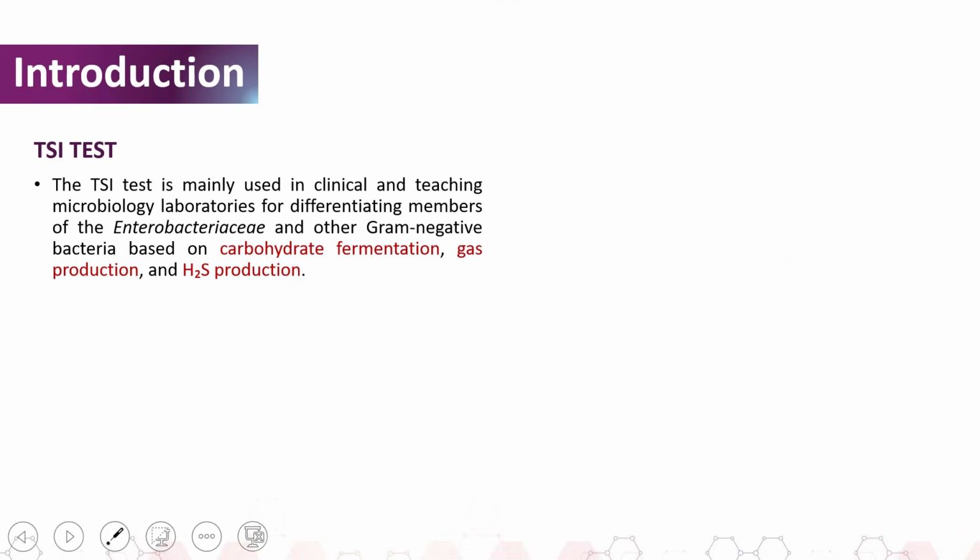Let's start our introduction by looking at what the TSI test is. Basically, the TSI test is mainly used in clinical and teaching microbiology laboratories to differentiate members of the Enterobacteriaceae and other gram-negative bacteria based on their ability to ferment carbohydrate, produce gas, and produce hydrogen sulfide.